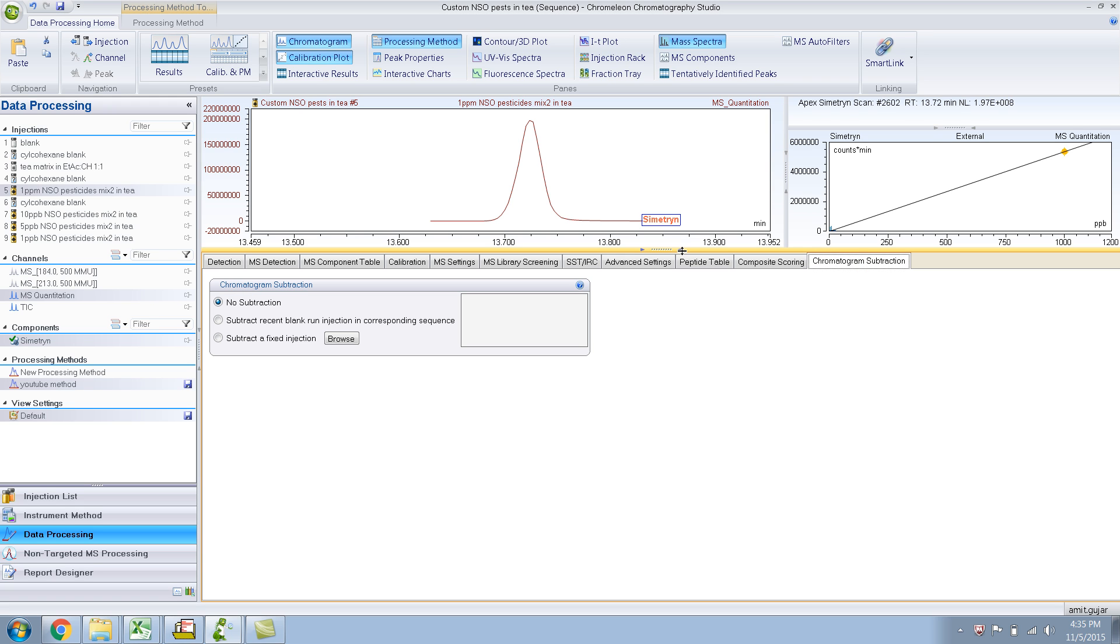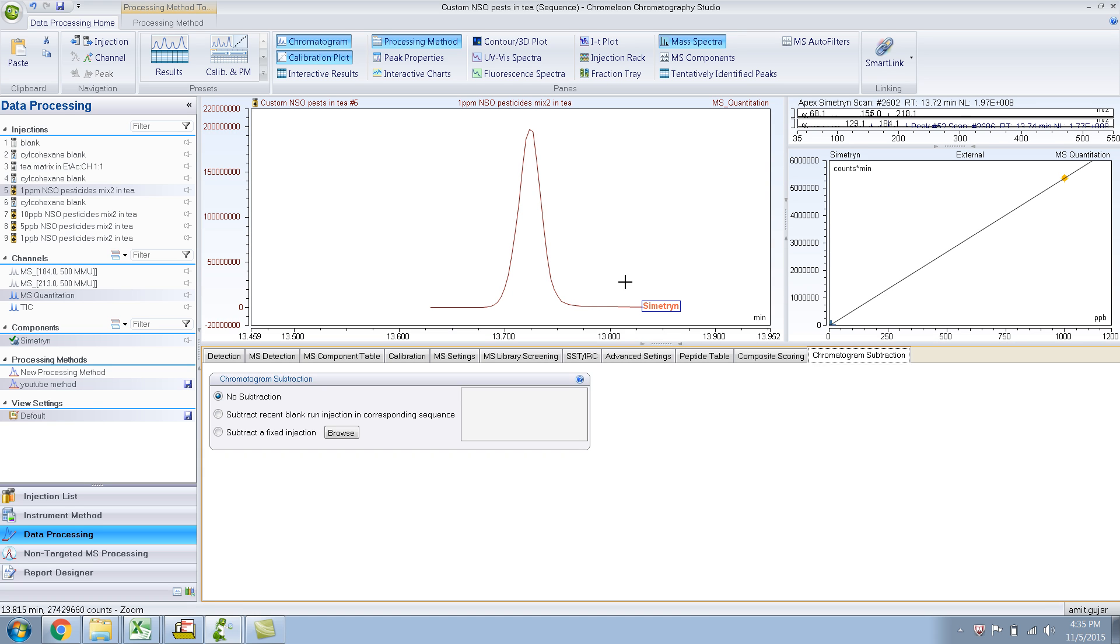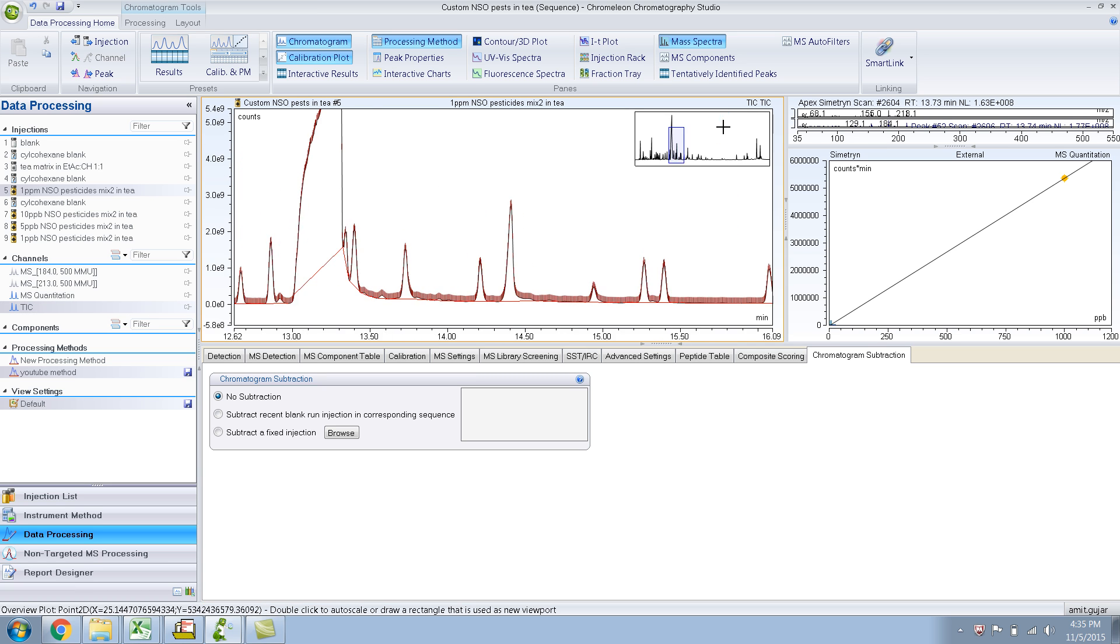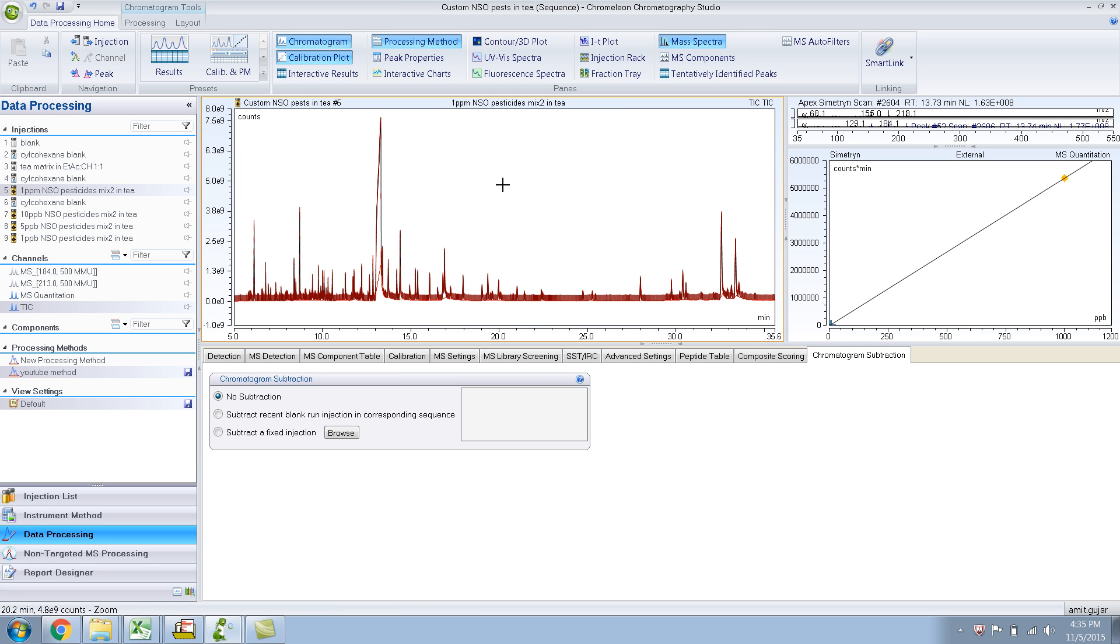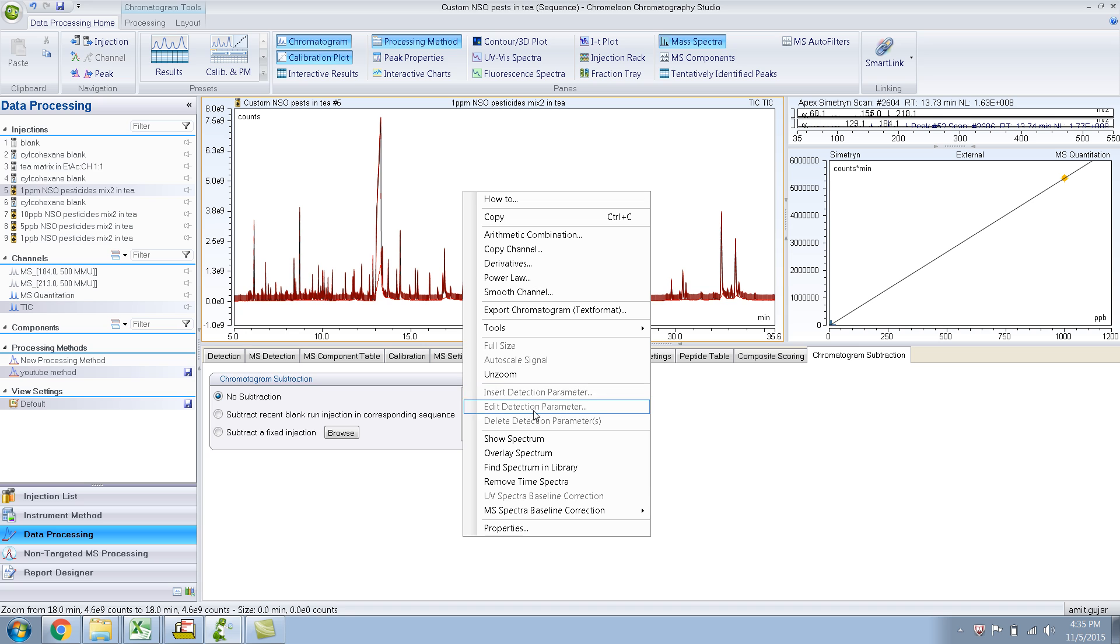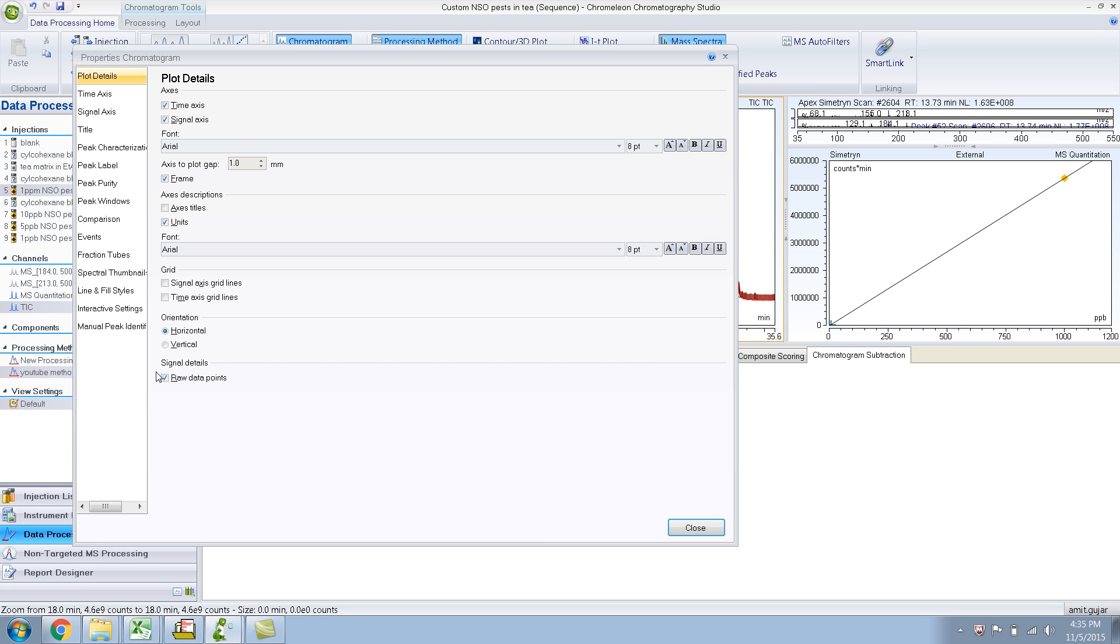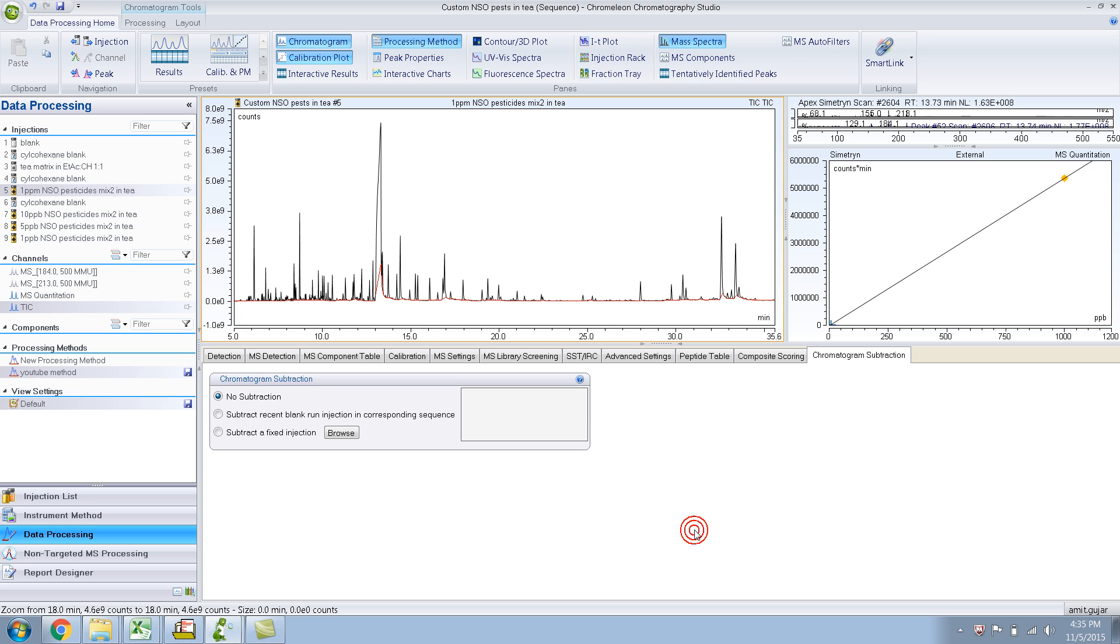Here, essentially, what I can do is I can subtract the chromatogram. Let me go to the tick. Let me go full scale. Let me remove this data point thing, the raw data points, so that you can see it more clearly. Right now there's no chromatogram subtraction.